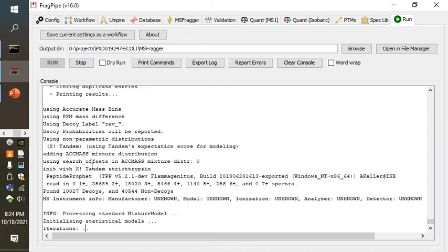All right, we can see that the accurate mass engine is going to come into play here. We did this search with a pretty wide tolerance of 20 ppm, 20 parts per million. I think most mass spectrometrists would be pretty disappointed if their Orbitraps or their FT instruments were 20 ppm off target. So in effect, by doing a search with a 20 ppm window, we have matches that are coming from all the way across that entire mass error range.